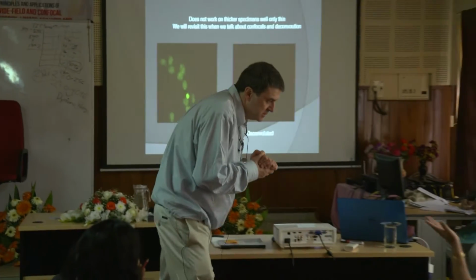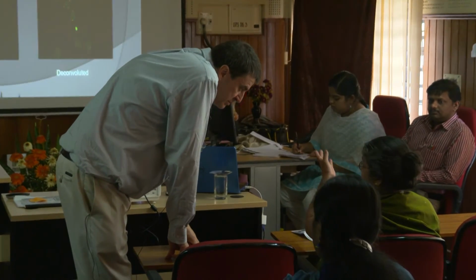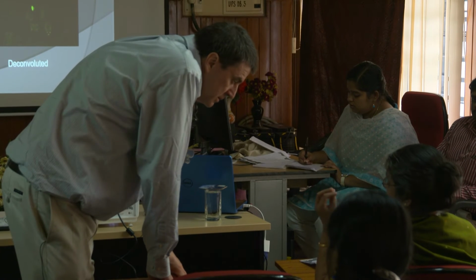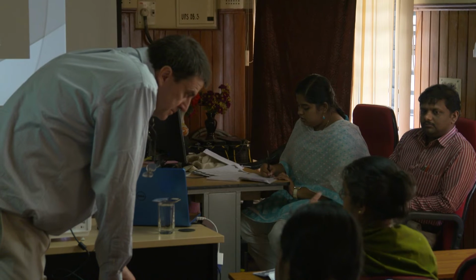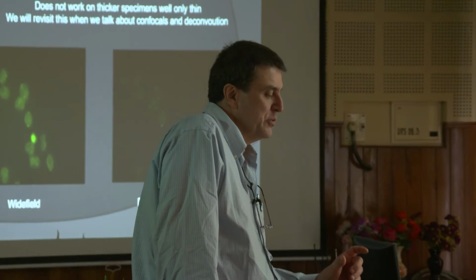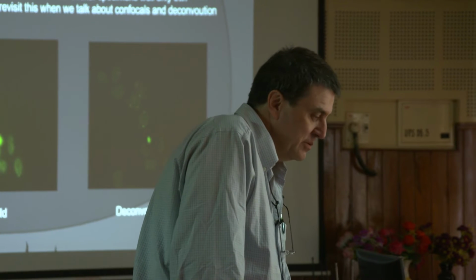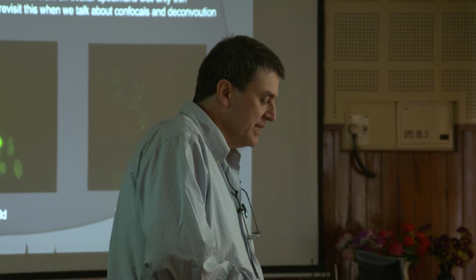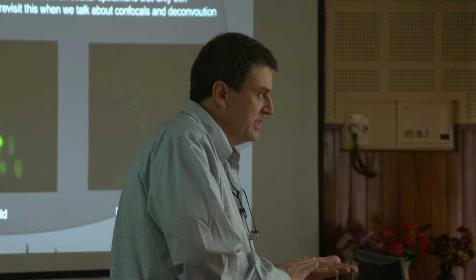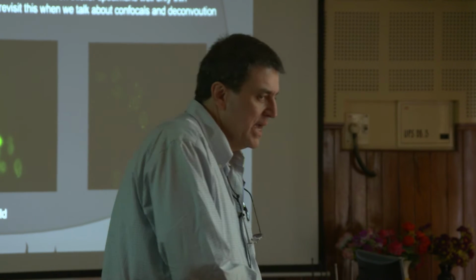Like slides, samples, you bought some slides as samples, right? For example, we have these Alexa 488 slides. We use them as a fluorophore, and we show them to the students for a class, and then again like that. So we are using the same slides for a long time. Right, because I used to be a microscope rep, and I used to have those same slides. They're expensive slides, but they've got a bit more specialty to them, so they will last again and again. I had my slides for 3 years when I was a microscope rep. So they put some extra chemicals on it. I don't know what they do, but I know exactly what you're talking about. It's like your demonstration slide. Yeah, something a little extra there.